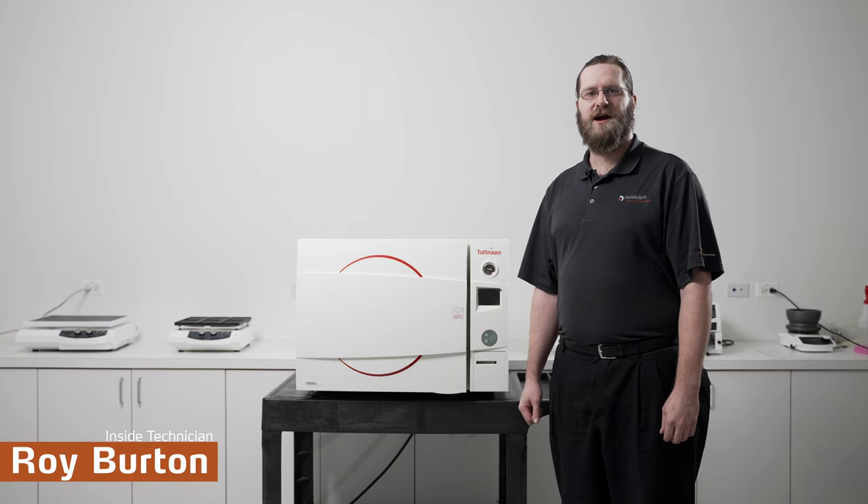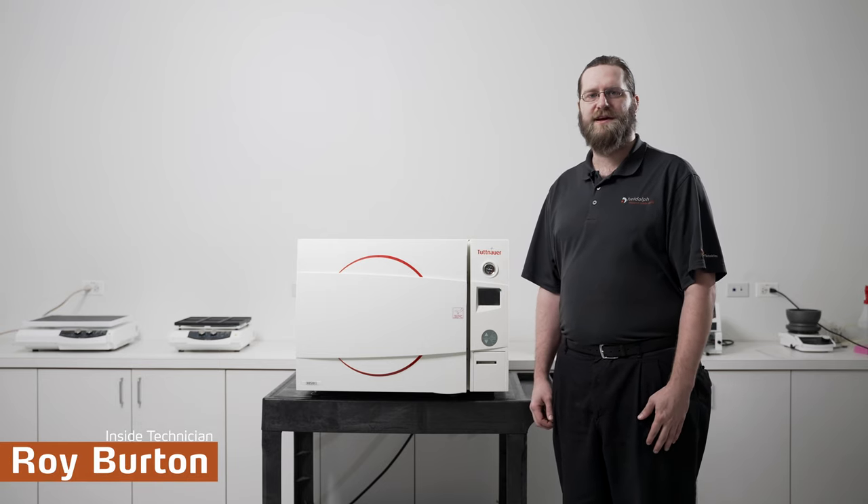Hi, I'm Roy Burton, the Inside Technician here at Heidolph North America, and I'd like to go over some of the external features on your autoclave.